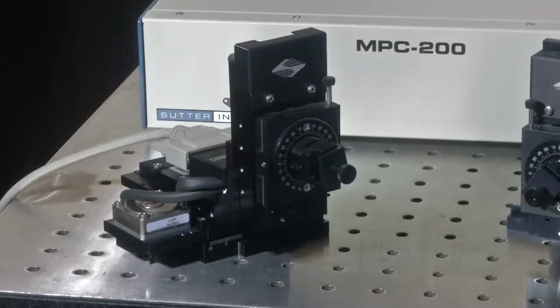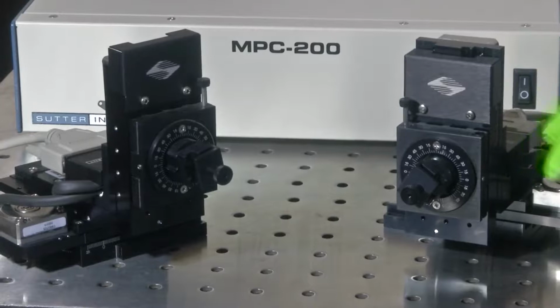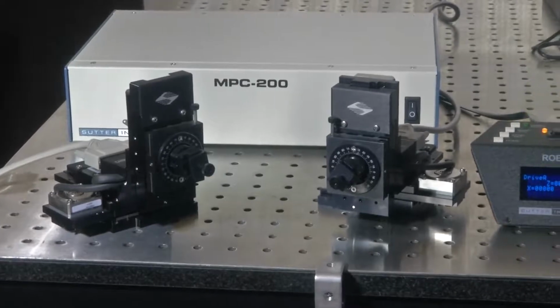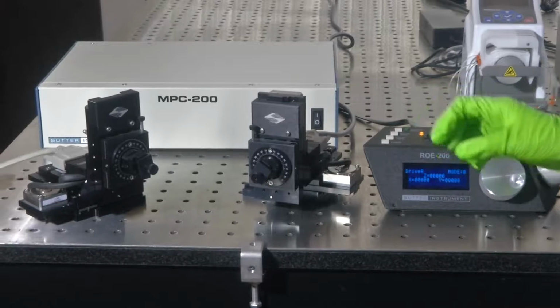Now, let me conclude with an application. Now that we have studied so much of micro manipulators, I have already told you how indenters with sensors can be used on these manipulators, and you could manipulate their location around the samples, cells and tissues which are micron scale. So, this gives more precise control over studying the electromechanical features.